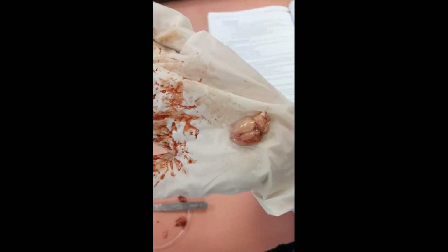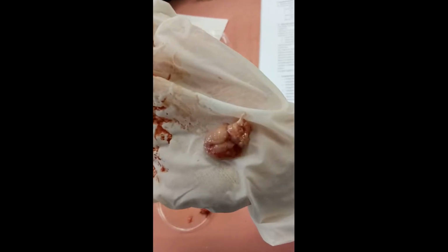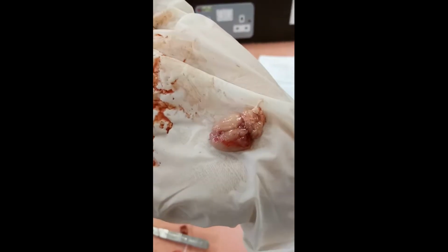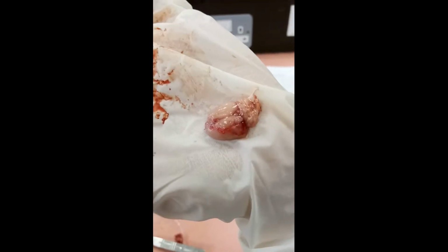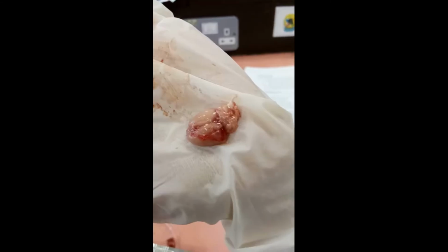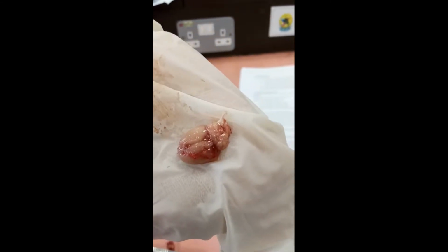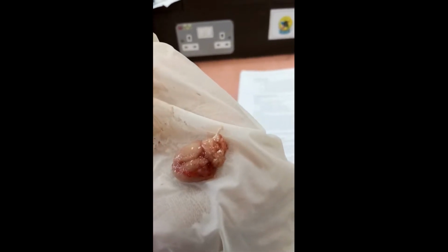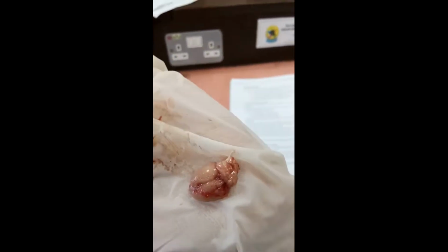For the rhombencephalon, there is the cerebellum, which is large and rounded in shape, posterior to the cerebral hemispheres on the dorsal side of the brain. The second is the medulla oblongata, which is the myelencephalon, the posterior portion of the brain. The posterior end of the medulla oblongata decreases and joins the spinal cord.